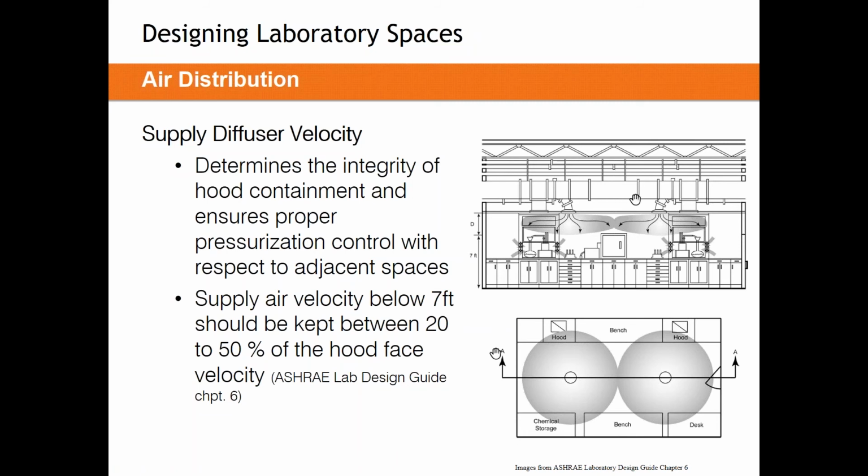This can be a tough part of lab design. So when you're placing diffusers close to each other or far apart from each other, take into account their velocities and their throw values, and make sure we deal with those collisions in that lab space as well. We don't want those collisions collapsing down on the fume hood and causing extremely turbulent air in front of the hood. Number one, it's going to be uncomfortable, but much more importantly, it will affect that 100 feet per minute heading into that fume hood.